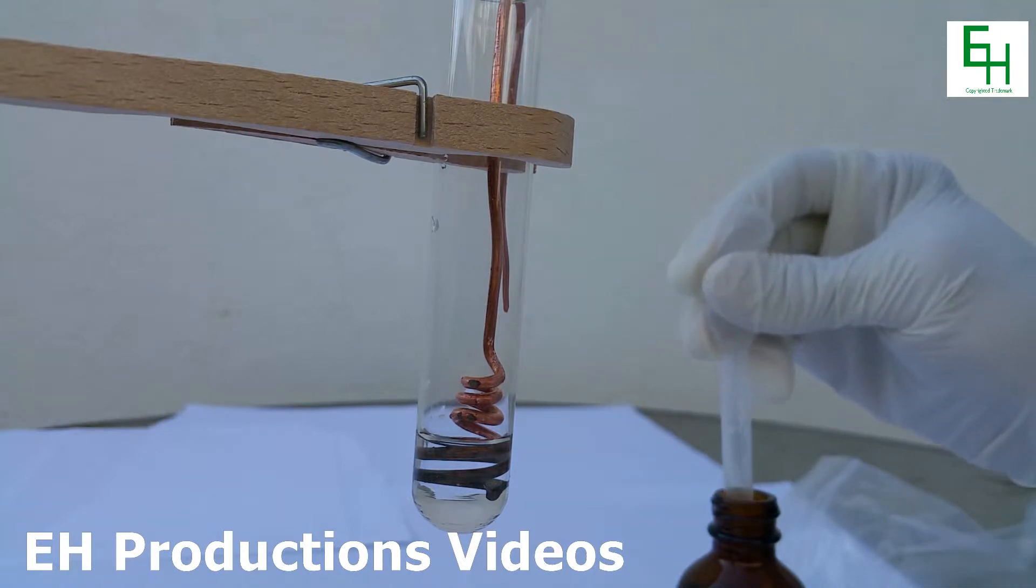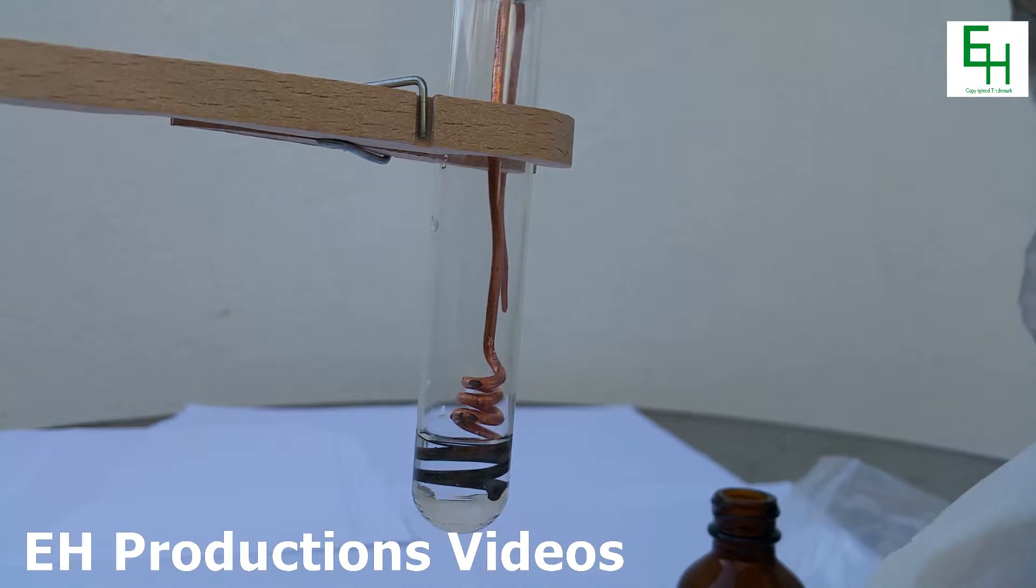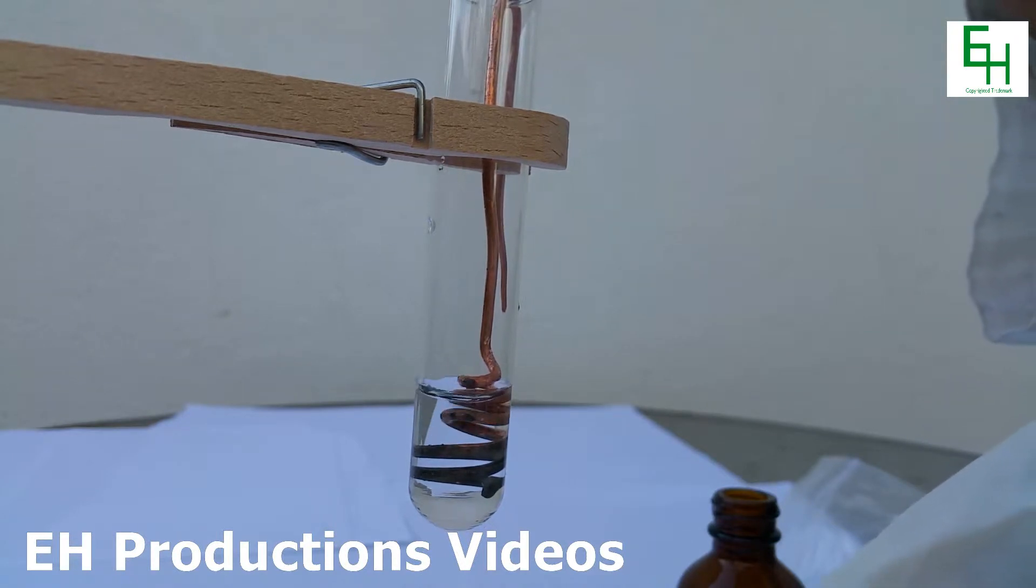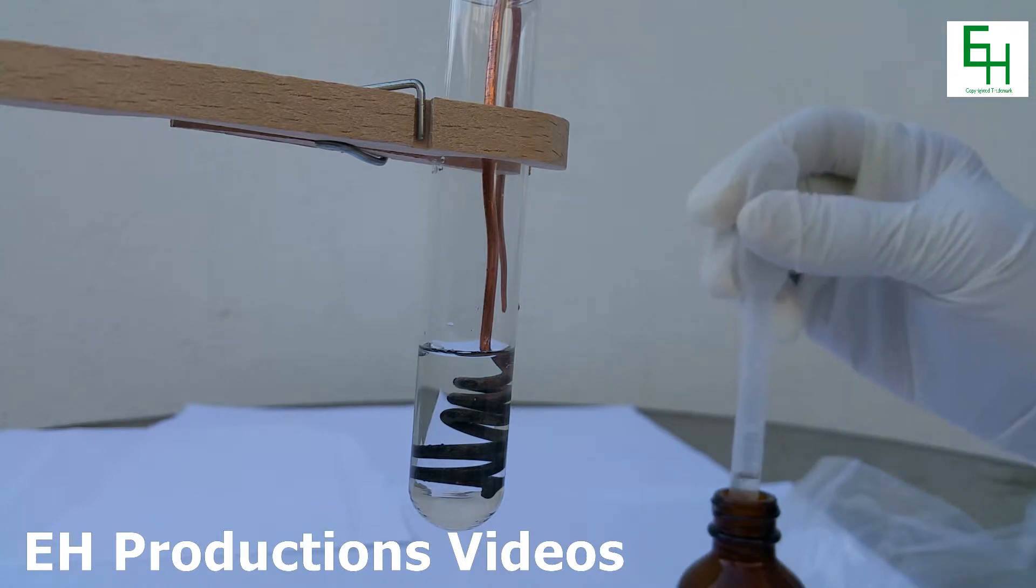I'm going to keep doing this until I cover the whole Christmas tree. You may notice that after I put the silver nitrate solution on top of the wire, the wire has been turned into a darker color. And just a little more.